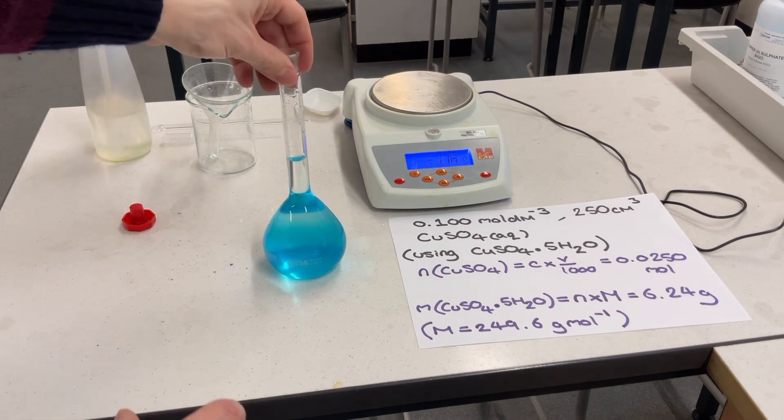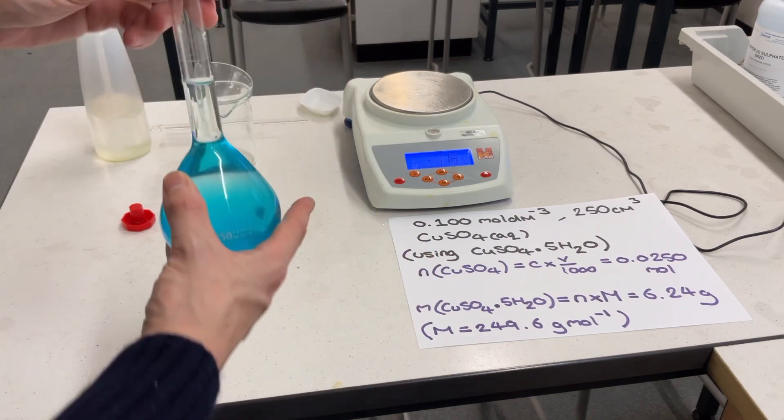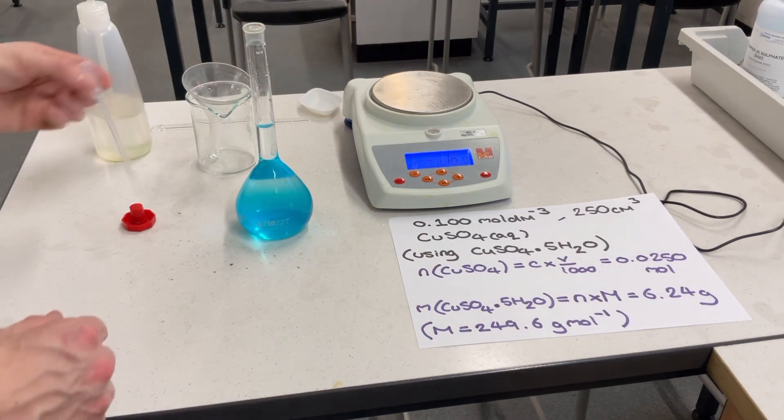Step 5: I now make up to the mark using deionized water so that the meniscus sits on the line on the neck of the flask. This is best achieved using a dropping pipette.